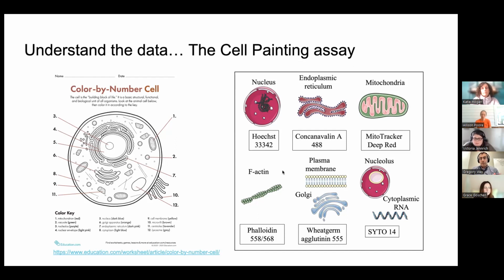And so these are well-established dyes that have been used for about 10 years. They're actually extremely cheap to acquire, and that's primarily the basis for their selection. We've worked with a lot of different collaborators to modify this assay in various ways, such as including a cell type specific marker or some other marker that might be more important to the system that we're studying, like maybe BODIPY if we're looking at adipocytes.